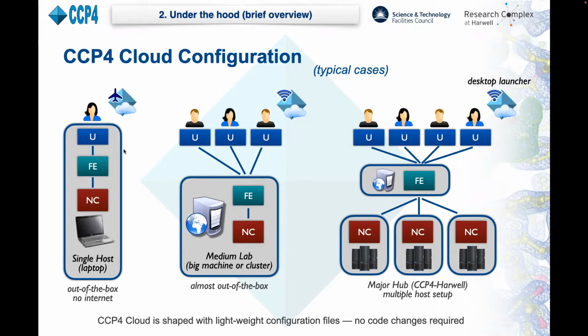And this configuration is included in the standard CCP4 distribution, and it works out of the box, essentially as an alternative to a desktop GUI. Exposing the front end here to the internet converts this single host setup into a server setup suitable for use in a medium-sized lab or an institute here in the middle.